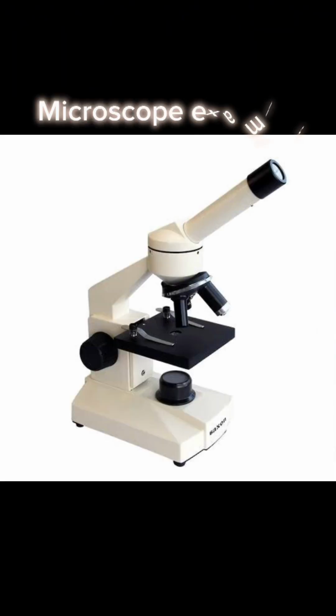Microscopy is a technique for making very small things visible to the unaided eye. An instrument used to make small things visible to the naked or unaided eye is called a microscope. There are two fundamentally different types of microscope based on the source of illumination: the light microscope and the electron microscope. The light or optical microscope uses visible light as a source of illumination. Because the light travels through the specimen, this instrument can also be called a transmission light microscope.